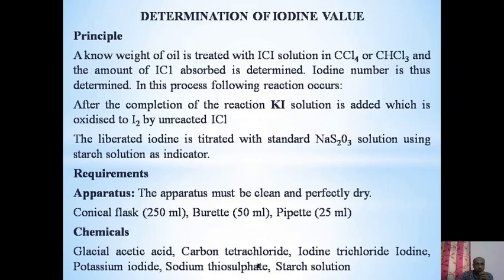So after completion of the reaction, potassium iodide solution is added, which is oxidized to iodine by unreacted ICl. The liberated iodine is treated with standard sodium thiosulfate solution using a starch solution as an indicator.